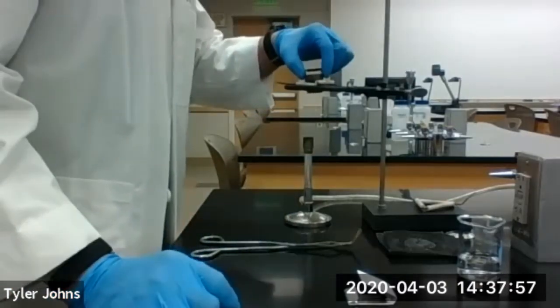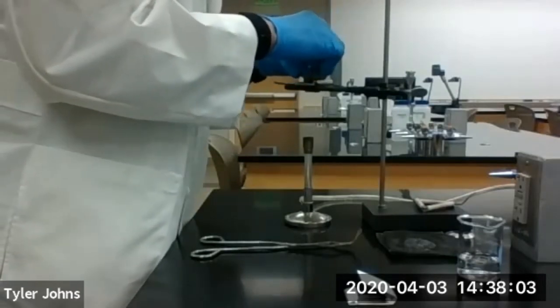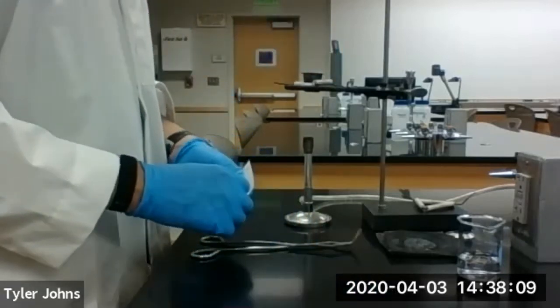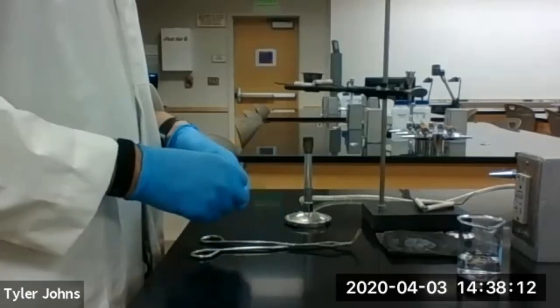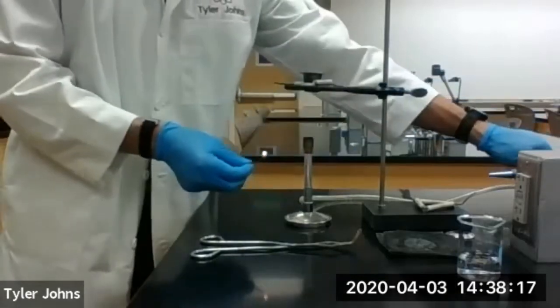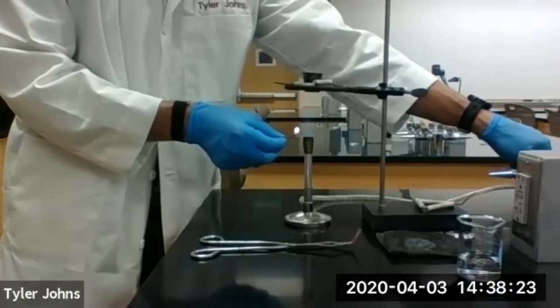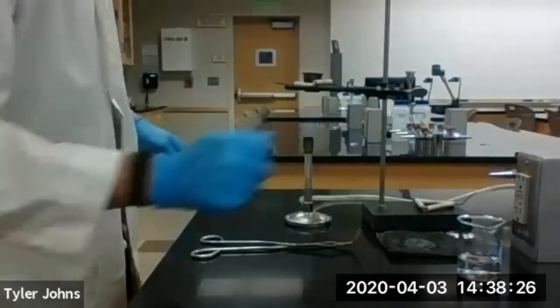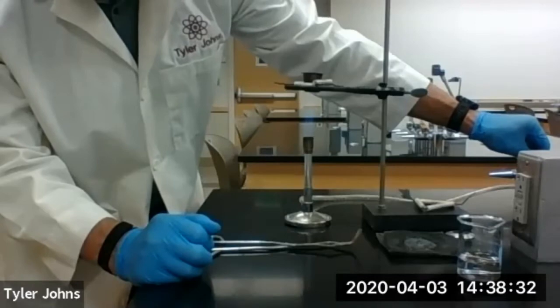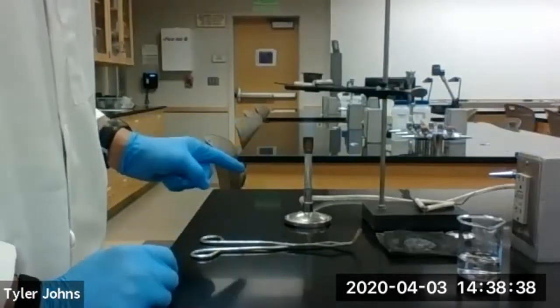We'll get our crucible set up, turn our cover on, and then we're going to go ahead and light our Bunsen burner. We'll let that heat for five minutes.